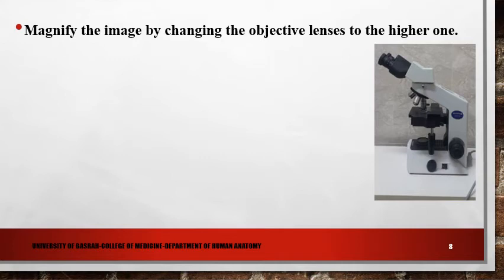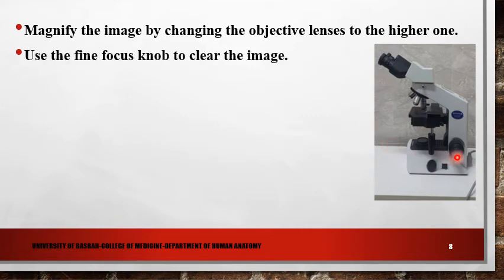Magnify the image by changing the objective lenses to the higher one. Start with 4x, then change to 10x and clear using coarse adjustment knob. If you need bigger magnification, use 40x or 100x, and use the fine focus knob to clear the image.